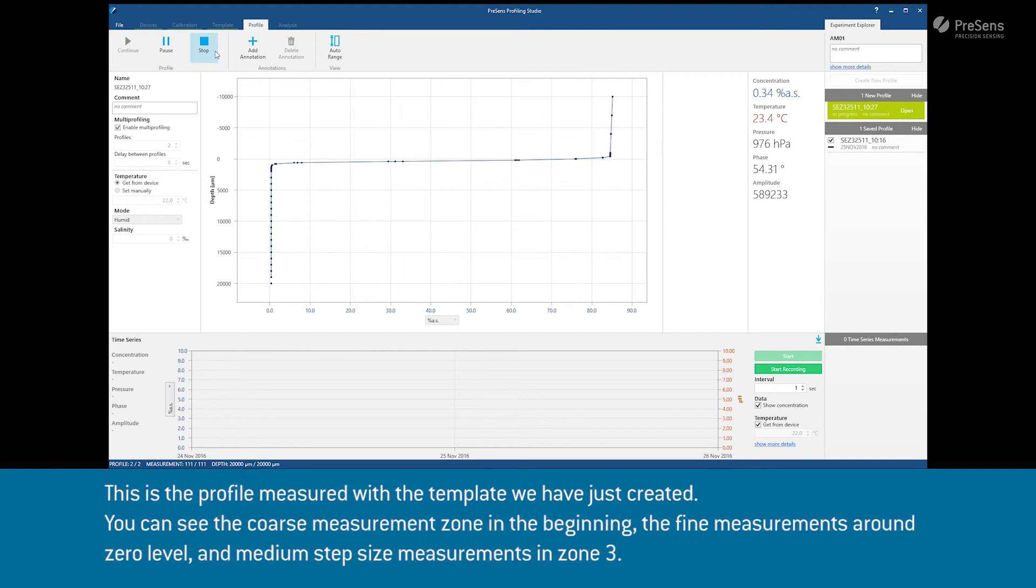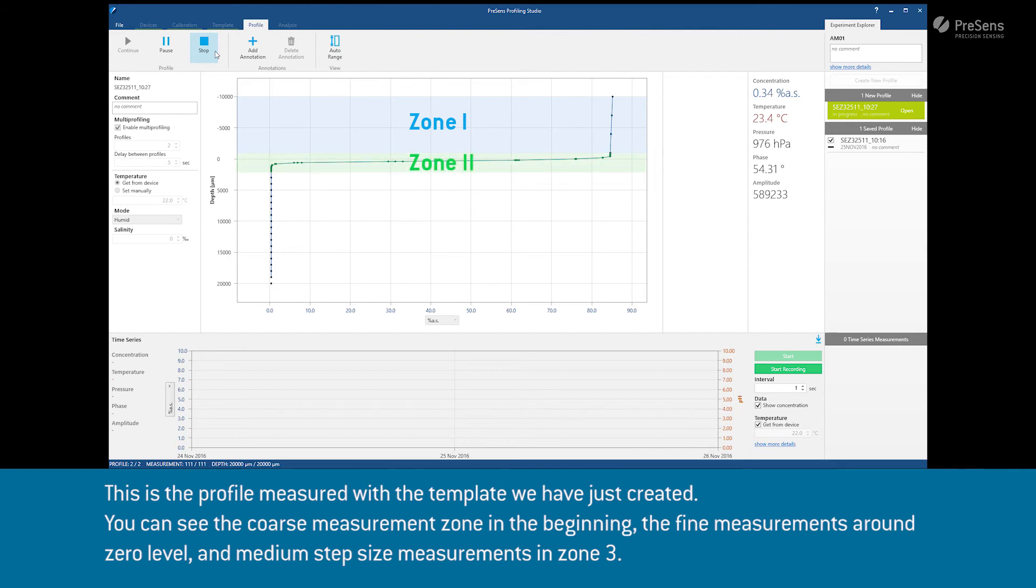This is the profile measured with the template we have just created. You can see the coarse measurements in the beginning, fine measurements around zero level and medium step size measurements in zone 3.